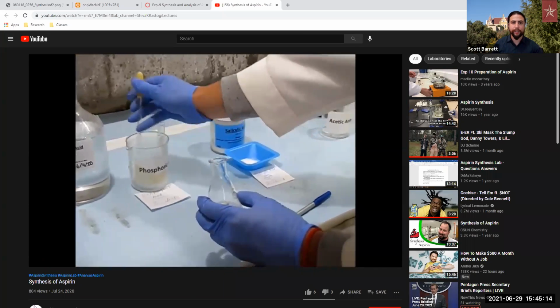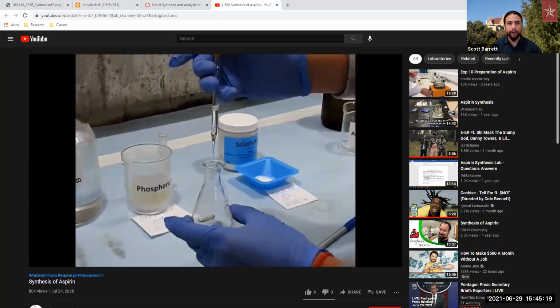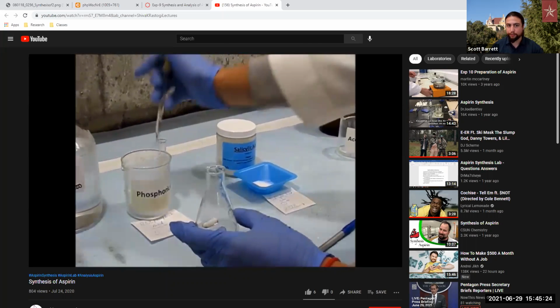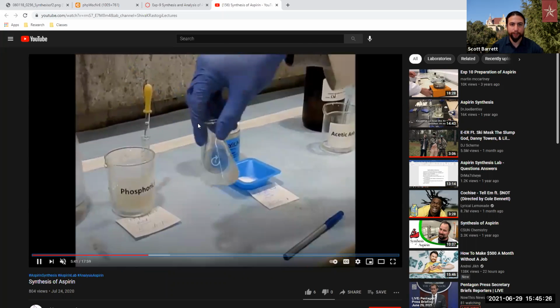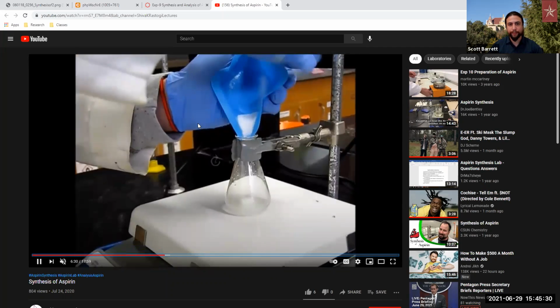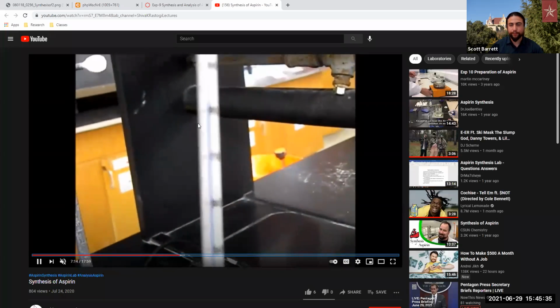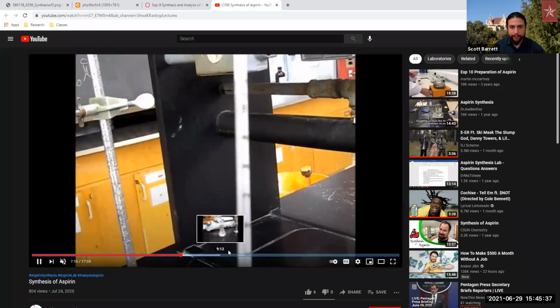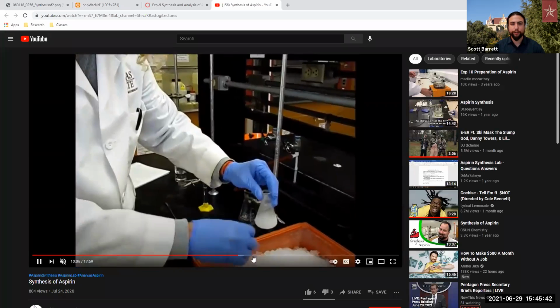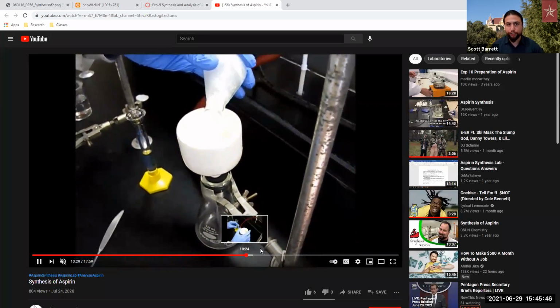You don't want to overdo these kinds of reactions, because it can lead to a lot of side products that will be unnecessary and possibly reduce your overall yield. So we just add in our 5 drops, and then we're good to go. You take it over, fast forward through here, add in everything, heat it up. It's going, watch your temperature, and then I'm going to jump through to come over to your precipitation, followed by filtration.